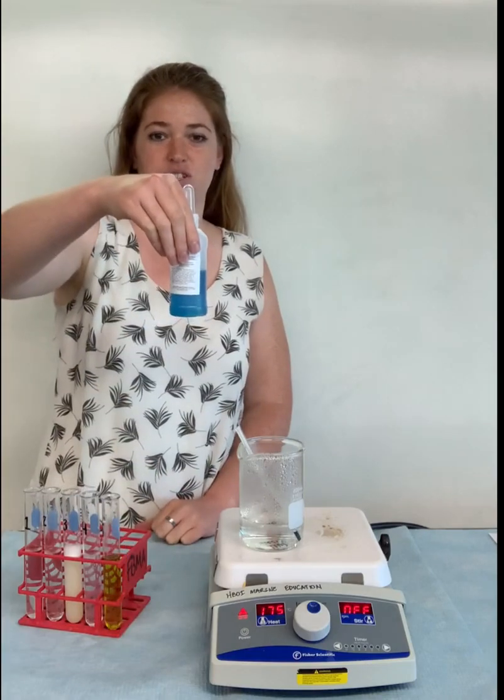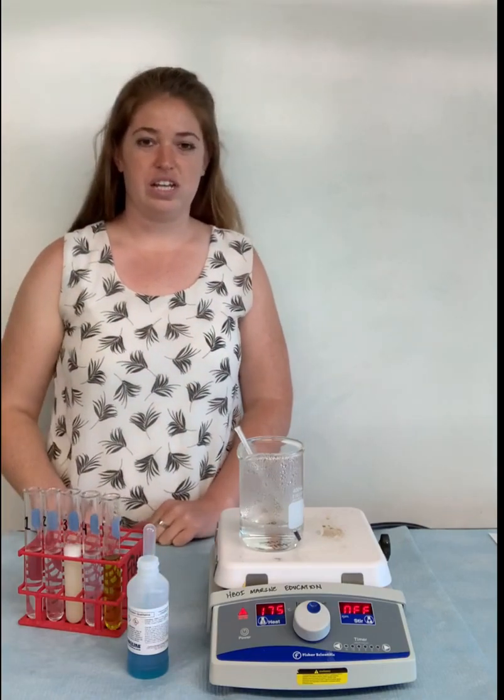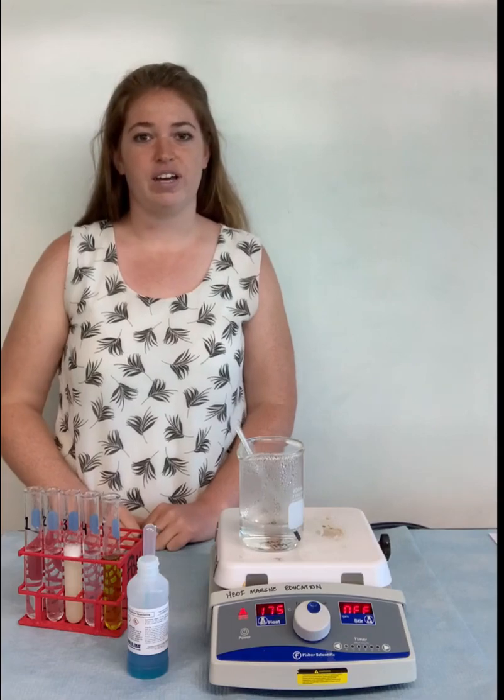This is our Benedict solution right here. You'll notice it's a light blue in color. And we're also going to need to use heat today. So with the Benedicts and the heat, if there are monosaccharides in our solution, we will see a color change.